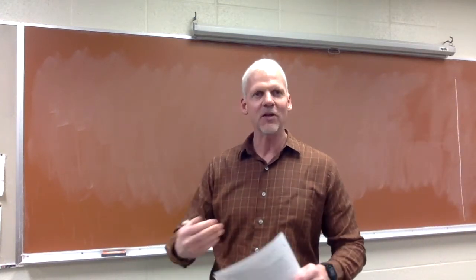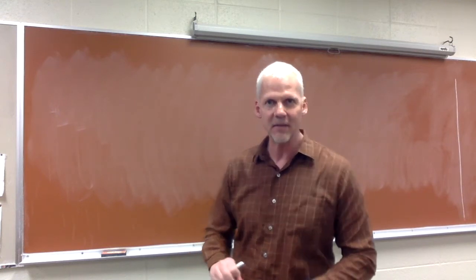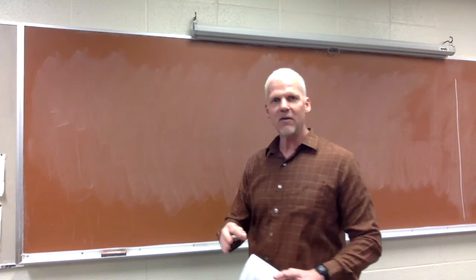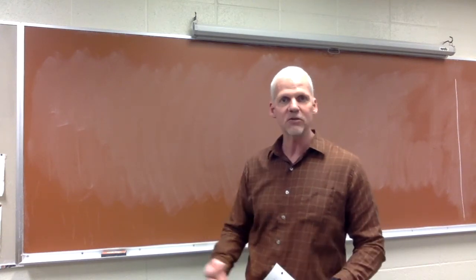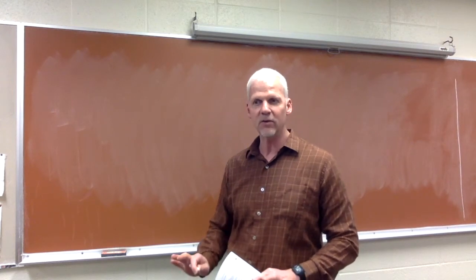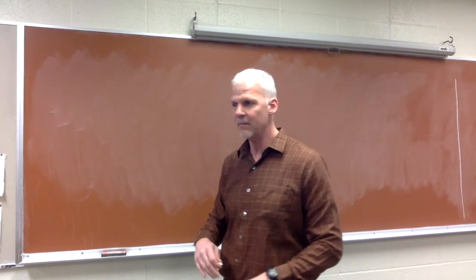So what we want to do is just give you a little pre-lab like we would during the normal lab meeting for the carbon-13 NMR experiment. As part of this, I like to go back and review where we've been and put the carbon-13 NMR in perspective with what we've already learned about using spectroscopy and instrumentation techniques to solve the structures of organic molecules.